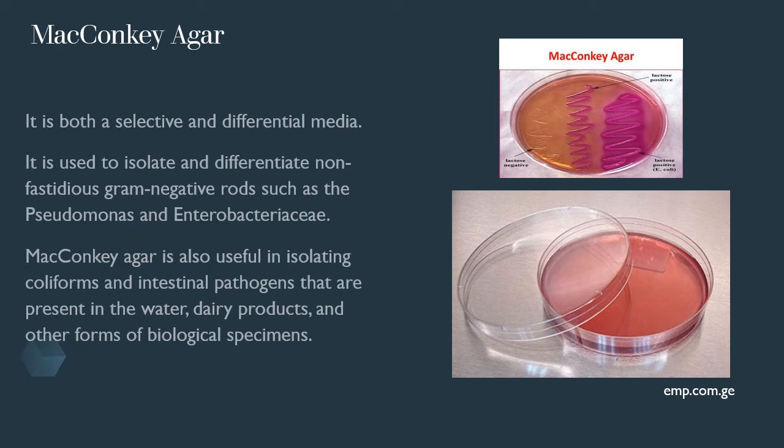The other isolate, which is lactose positive, shows growth of the microbe that is pink in color. But in case of E. coli you will also see the media around the growth of the E. coli change color, it is also pink, right? So this is how you differentiate.